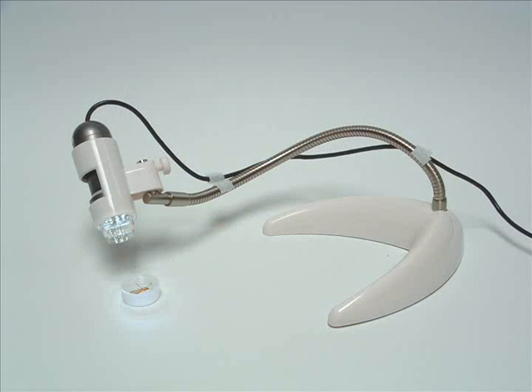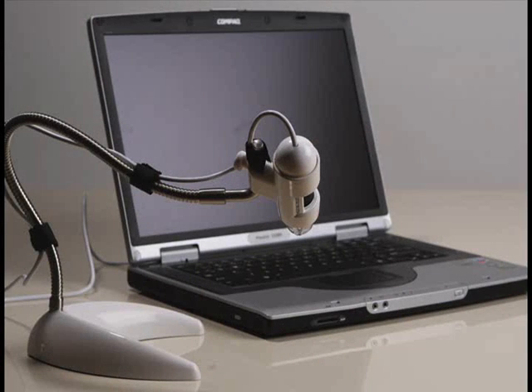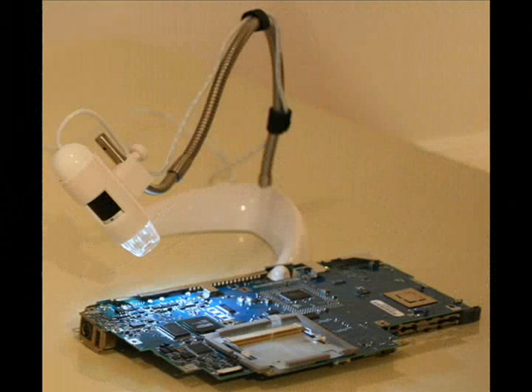Now you are ready to use your MS-21W Articulate desktop stand. There are many angles and views that you can use for your viewing pleasure. Enjoy!